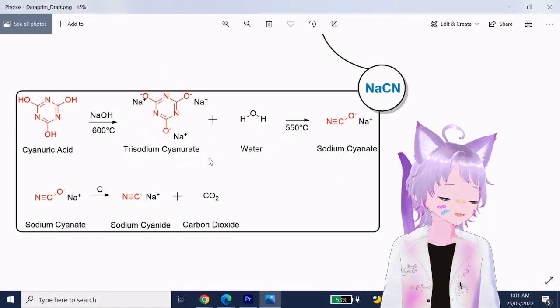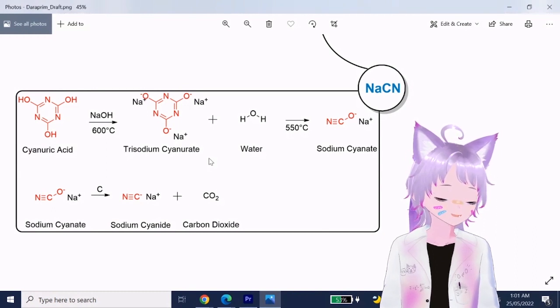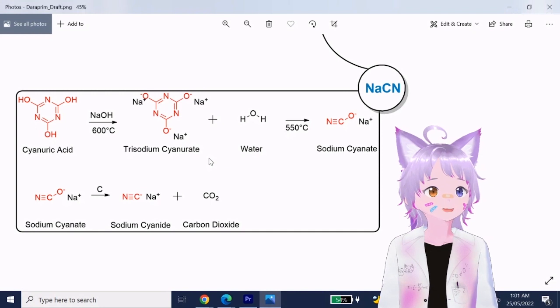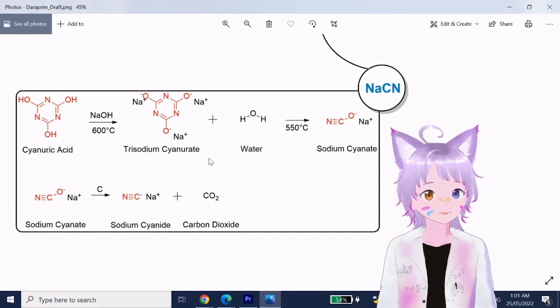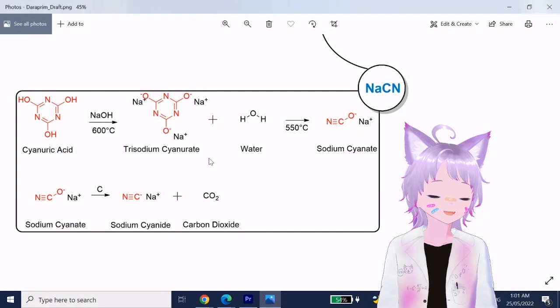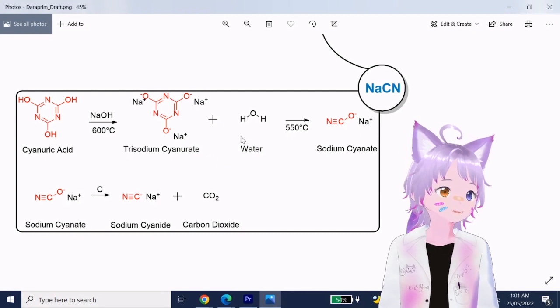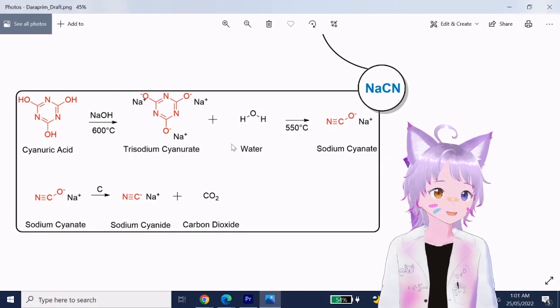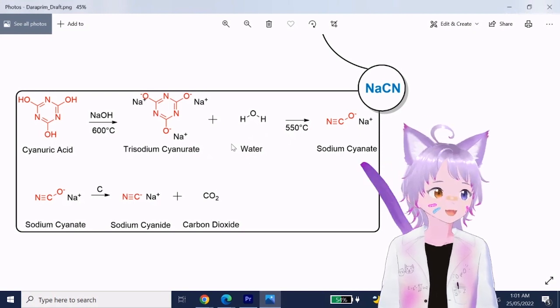I have another idea. It's actually quite brilliant. You know what we should do? When we form sodium cyanate, right, in situ, it reacts with carbon to form sodium cyanide. What if we do the two steps separately? What if we extract pure sodium cyanate from the reaction mixture without adding carbon yet? Quite literally, we allow this to form sodium cyanate and whatever crap byproducts are there.